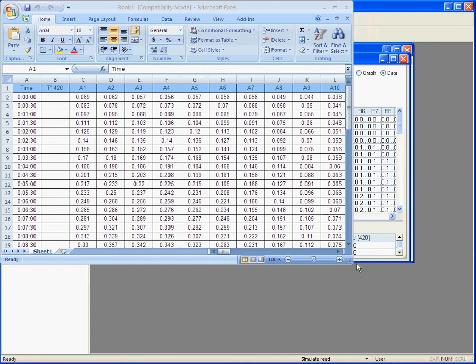Here, all of my data for a 96-well plate has been exported to Excel in one click.